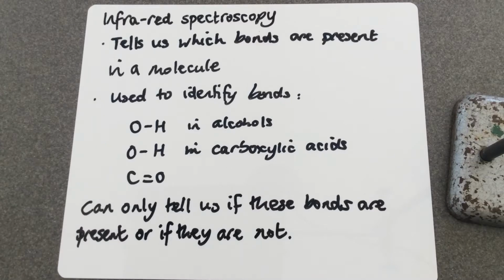The purpose of this video is to teach you how to interpret infrared spectra. Now, infrared spectra is a really powerful analytical tool to tell us the types of bonds present in a sample of a molecule.